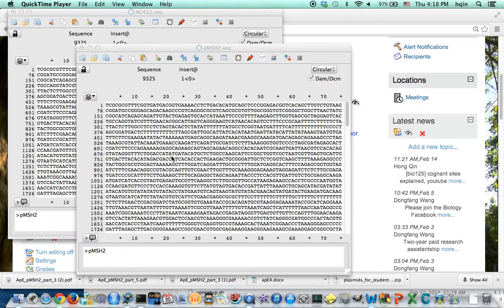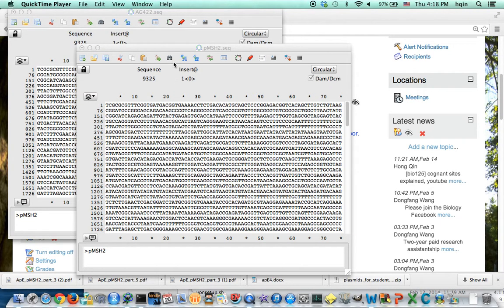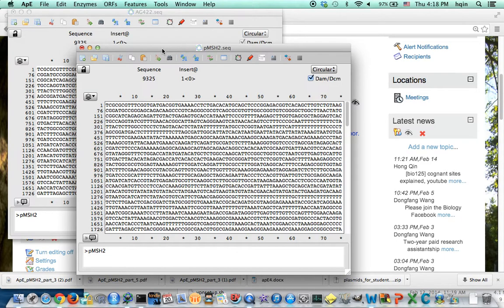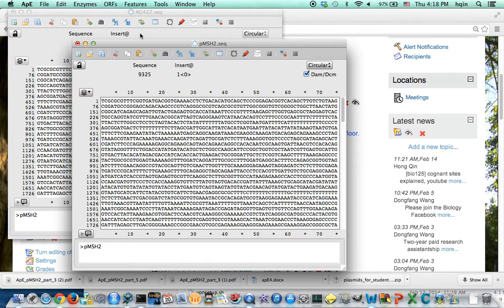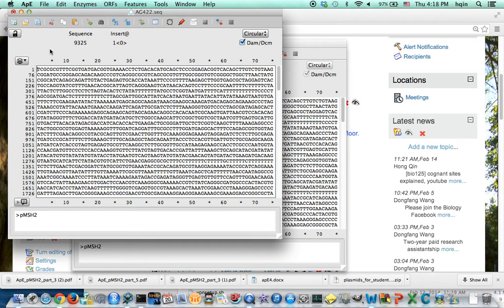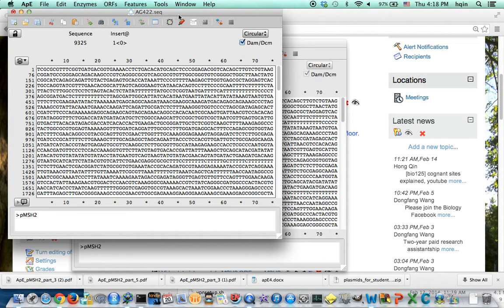So first we are going to find out where the mutation is located between the wild type MSH2 and the mutant MSH2. So here is the wild type MSH2 sequences, this is one of the mutant AG422.